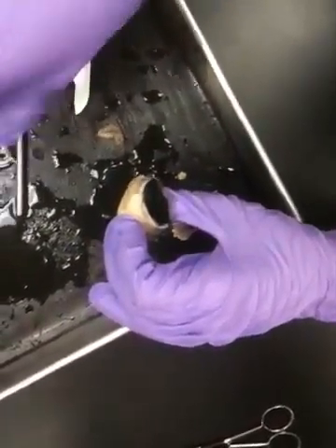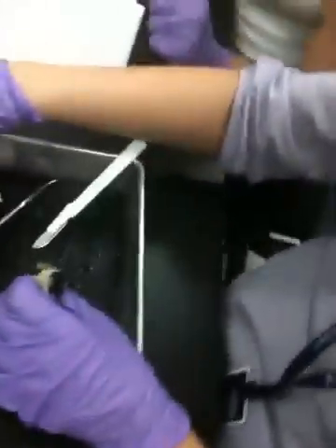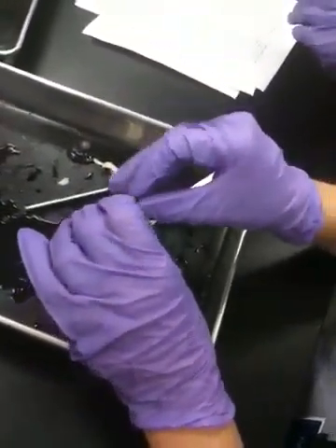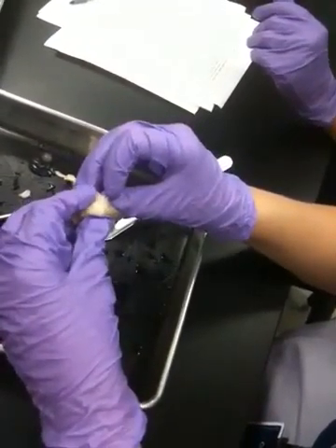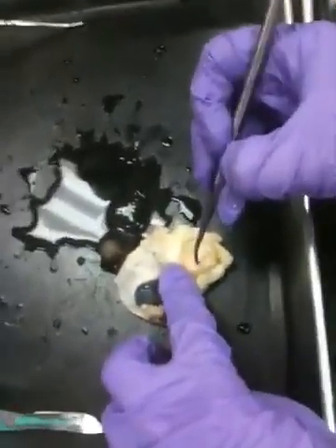The easiest way to double check that it's the optic nerve, and whenever things are out like this, I did it for the cat, you may not have needed it, but whenever things are out like this, I'll always put gloves, pointers, things for you to do it, because one of the easiest things is to feel it. You can feel the hardness of the optic nerve, and it's very different from all the other tissue. We can also see it, let me show you on this one, really nicely in this, more vitreous. Okay. Here, see this little ball? This is the optic nerve.